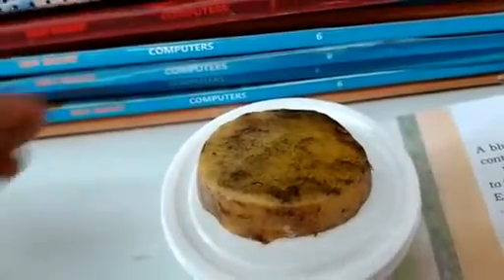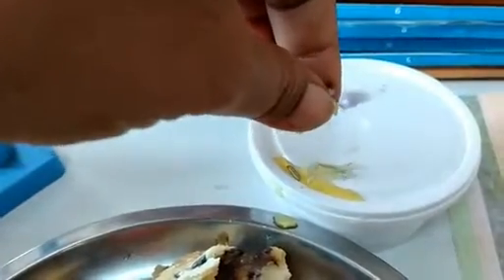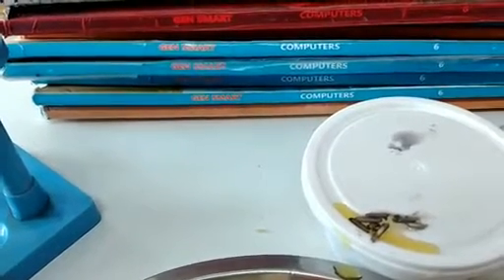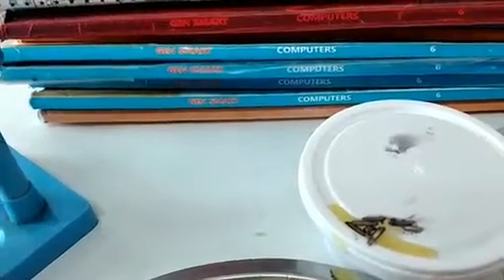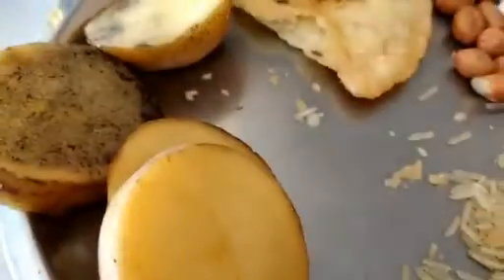Let's do the same test on rice. I'll put rice particles. You can see rice particles also turned blue black, which tells it contains starch in high level. Okay, this was your starch test.